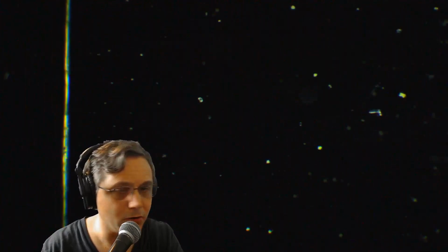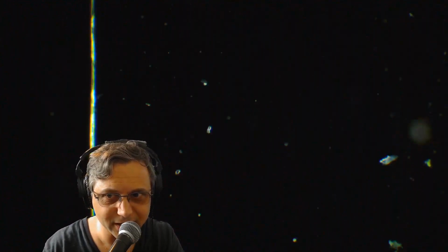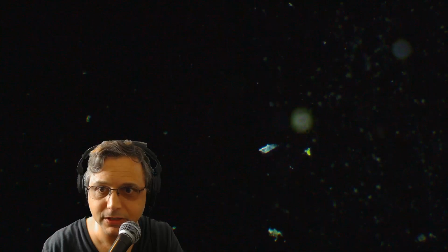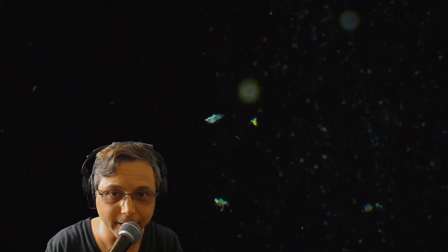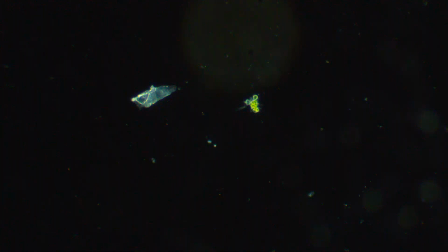The problem with this is, one drop at a time. Can only go one drop. Here's something. What's this? I'll take myself out here so we can take a better look at this. Yeah, it looks like a rotifer. There might be a little air bubble there. I try to prevent air bubbles as much as possible. I can see one on the slide that's right in the middle of the cover slip, but we're off to the edge right now.